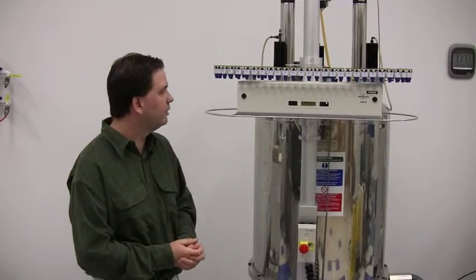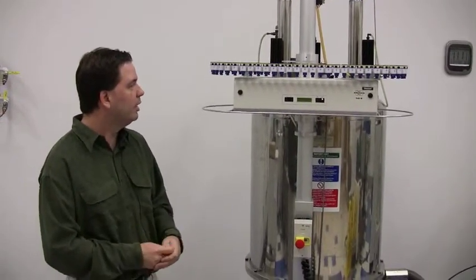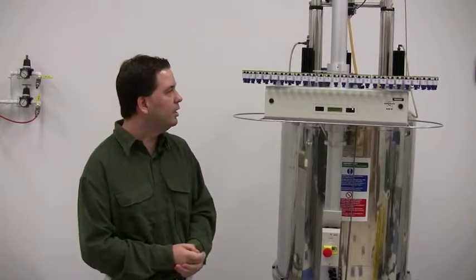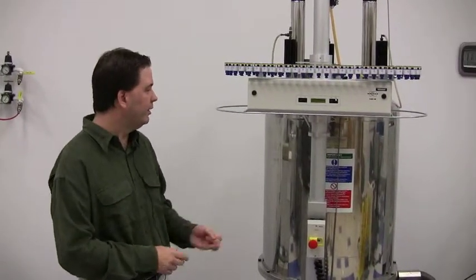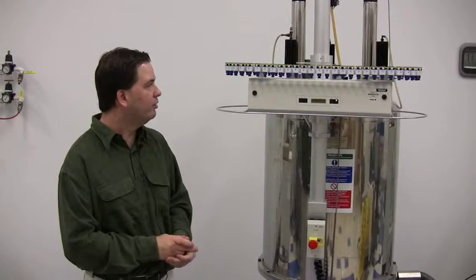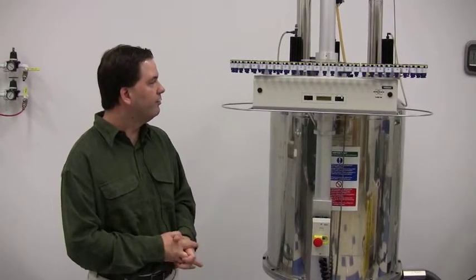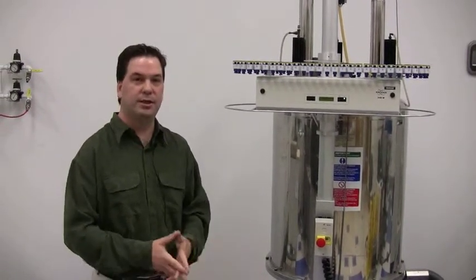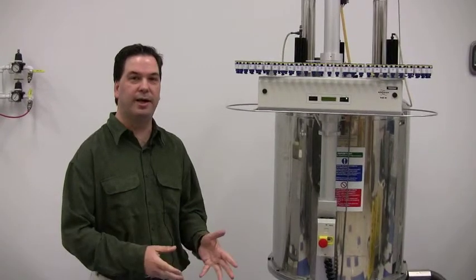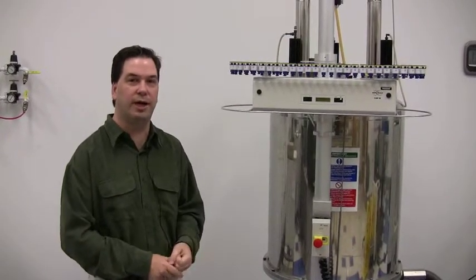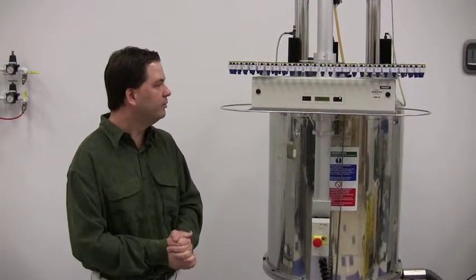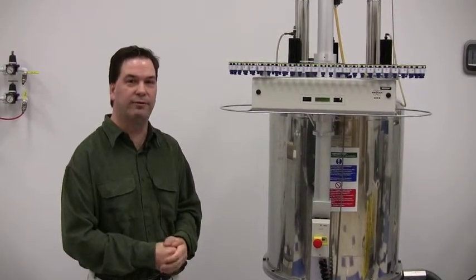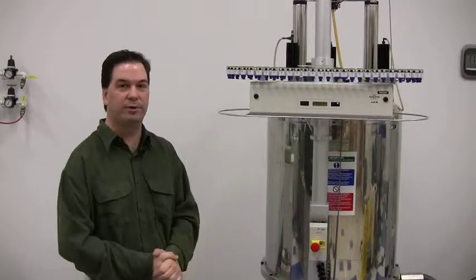Once again, we focus on this spectrometer for short acquisitions, optimized for proton, and also we're able to observe any nuclei from phosphorus-31 down to silicon-29. So odd NMR nuclei such as silicon-29, nitrogen-15, or any other type of nuclei that has an NMR active isotope can be acquired on this spectrometer.